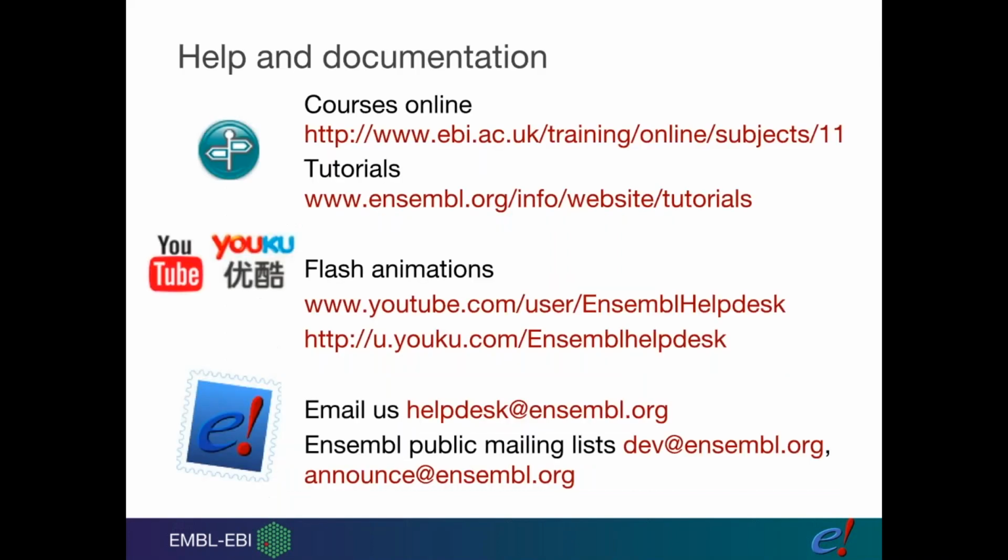There is loads of help and documentation on using Ensembl. I will apologise that most of the videos and things you'll see will be using human as their example, because it is our number one species, and wheat is down at number three. But almost everything is applicable across onto what you might be doing with wheat.